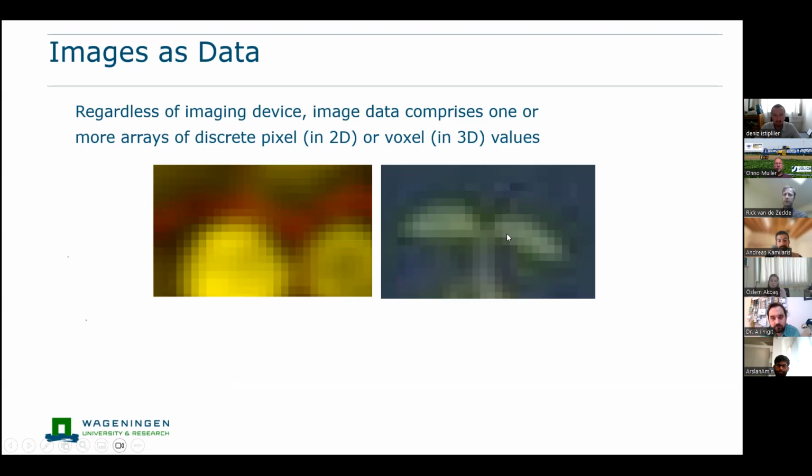And this is actually image analysis. It's this thresholding. You could do it in 2D. Of course, you could also do it in 3D. The example that I will show actually also face this challenge. But with root phenotyping, the problem is even worse because you need to somehow make a picture of your root system.